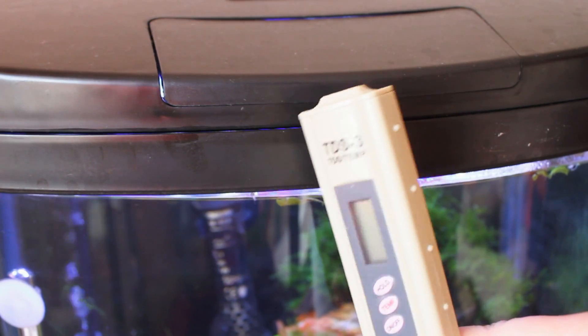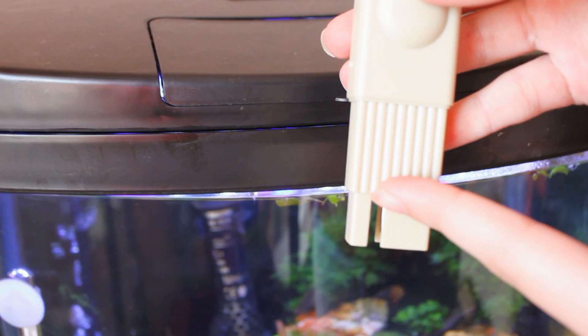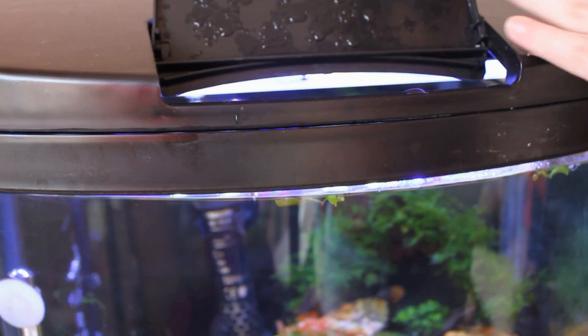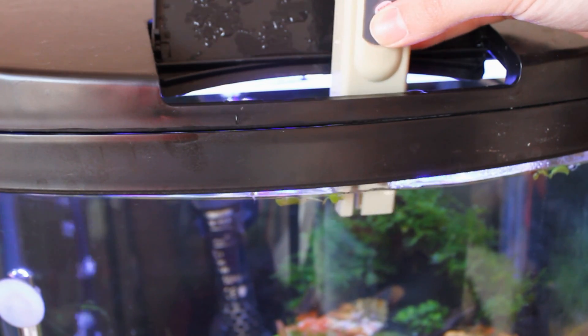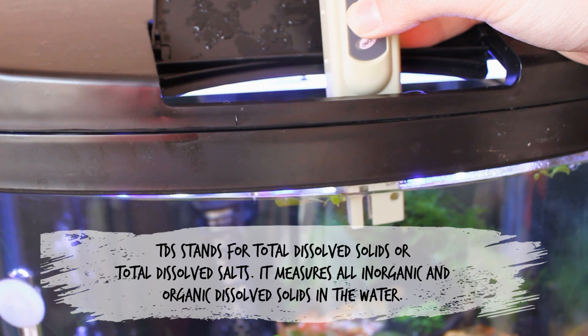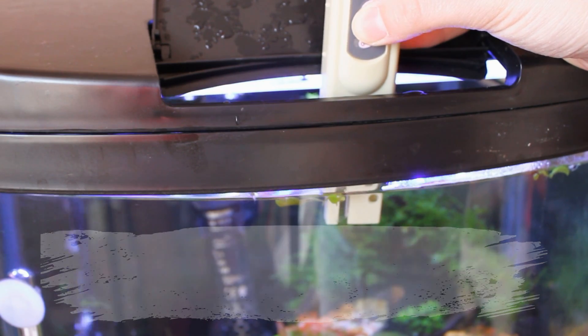We'll do the first test, the TDS meter. You have to dip it in the water up to here, you don't want to go beyond this point. Let's just pop that in there, you can see that go in, and then we press on and it says 157 ppm.